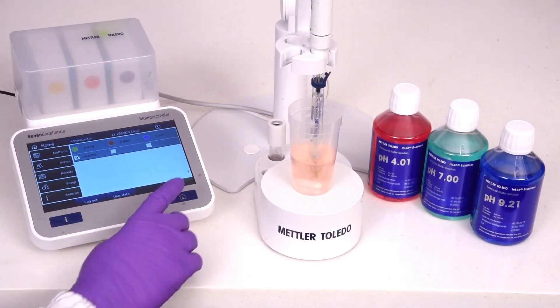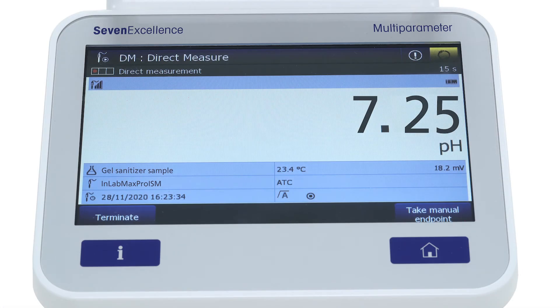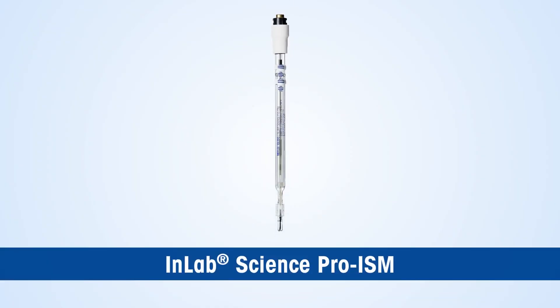For sample measurement, take aliquots of the hand sanitizer samples in a clean beaker so as to ensure that the junction is well immersed into the sample. Measure the pH of the sample at the required temperature.